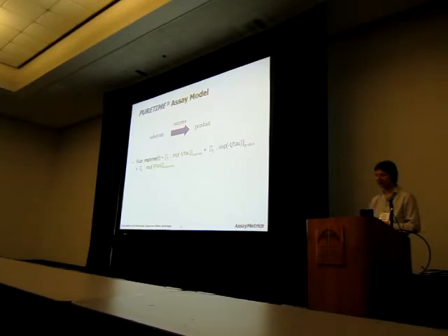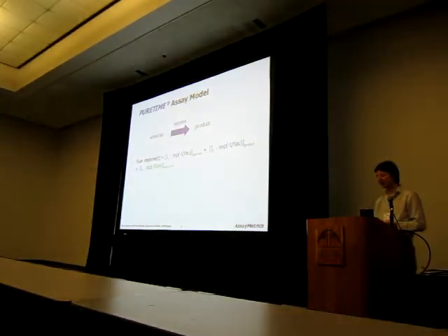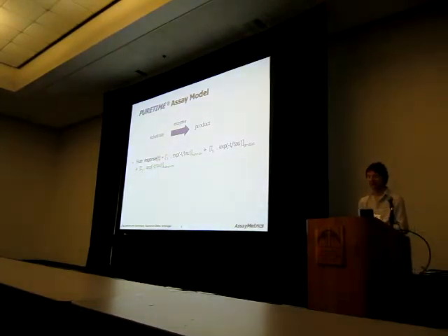With fluorescence lifetime, it's exactly the same, apart from the fact that you get additional information. What we've done here is write out in the form of a simple equation the fluorescence time response. And what you see here are three exponential terms. The first term here in orange is the response to the substrate, decaying away. If you look at that exponential function, minus t over tau, tau is the fluorescence lifetime of the substrate.